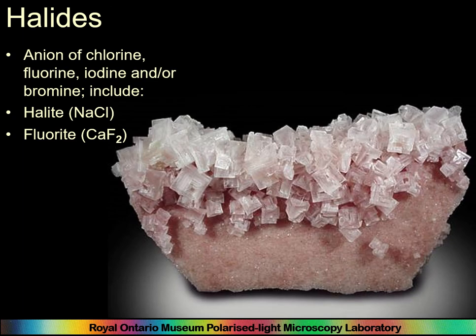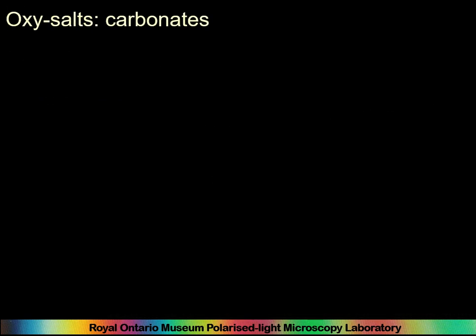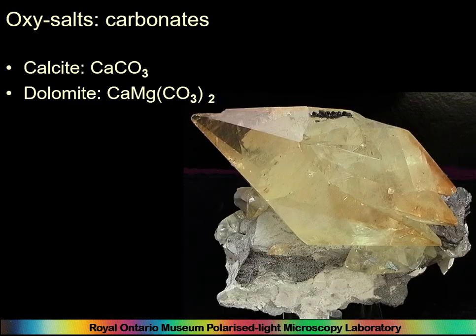So the halides, again, are very important. Salt is a halide, but you don't get them in thin sections, so don't worry about them. The oxy-salts, including carbonates, are very important rock-forming minerals. You will get to know calcite very well. It will become your friend. Calcium carbonate.